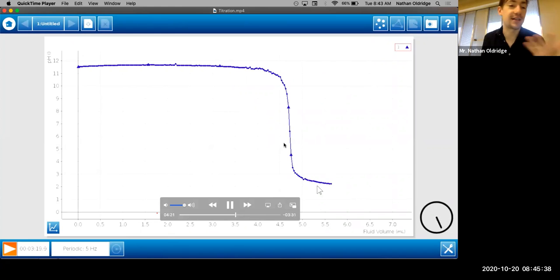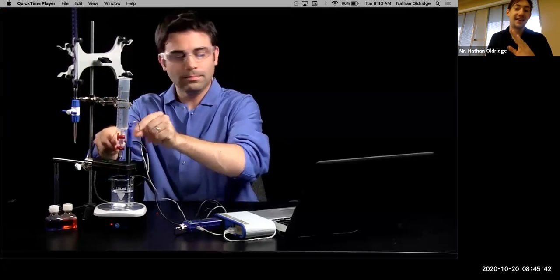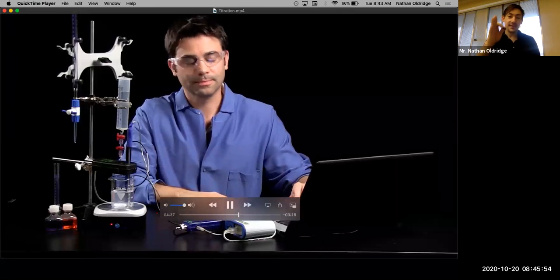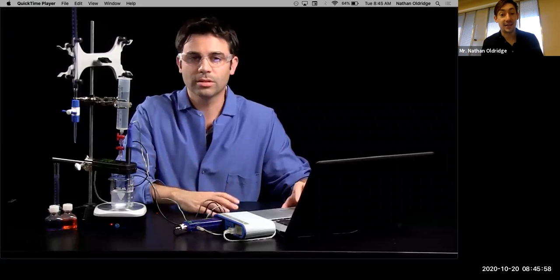As soon as you've neutralized all the base, the pH goes below 7, and he's done with that. You can see that the pH of the final solution ends up being closer to 2 because he just kept adding HCl, even though all the NaOH had already disappeared. So that is a classic strong acid, strong base titration curve.